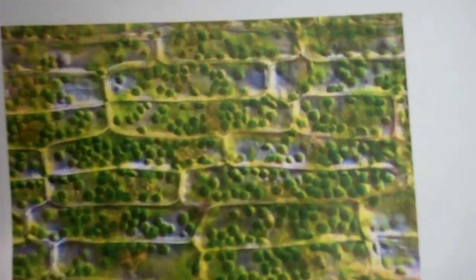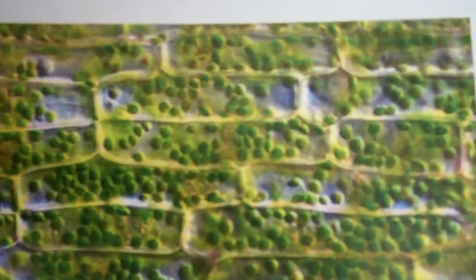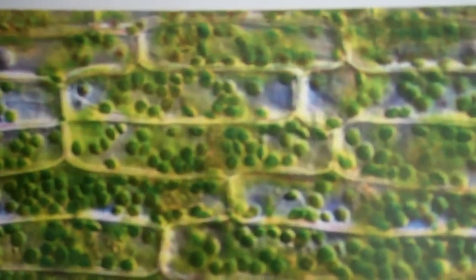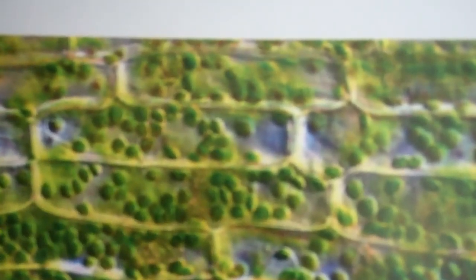This is what the cells will look like. So you're going to see some bricks. Those are the cells, and inside those bricks are little tiny green round structures called chloroplasts. And if you look at the picture, you can see that the chloroplasts are all over, spread evenly throughout. And that is the normal state of Elodea under tap water.